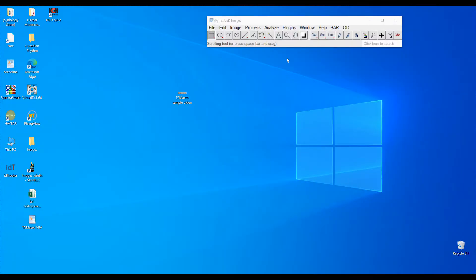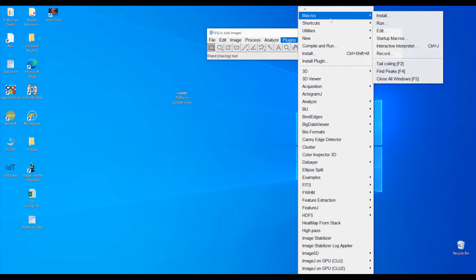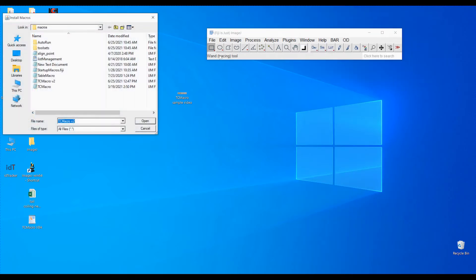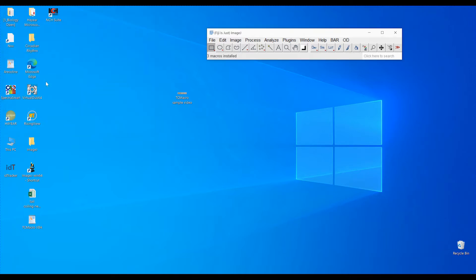I will be guiding you on the process of using ImageJ for data extraction of tail coiling. First, after we open ImageJ, you need to install the macro. We install the macro by clicking on Plugins > Macros > Install, and you need to navigate to where you put the macro. Here is the TC macro v2, which is the macro we provided. We open it and we will have three macros installed.